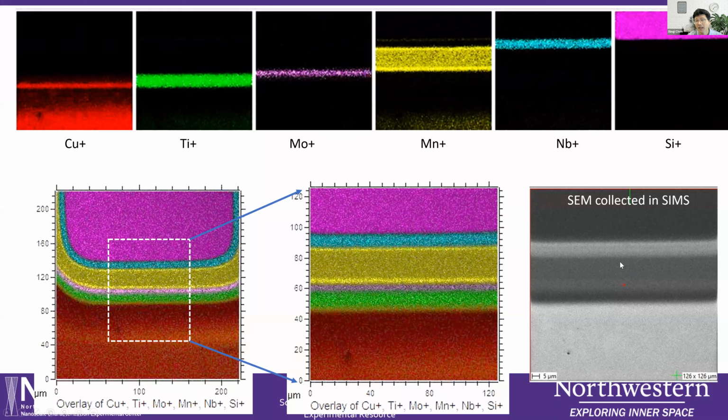This is an SEM mode from SIMS. SIMS also has an SEM mode, and this doesn't have elemental information. From the other one, you can get elemental information.